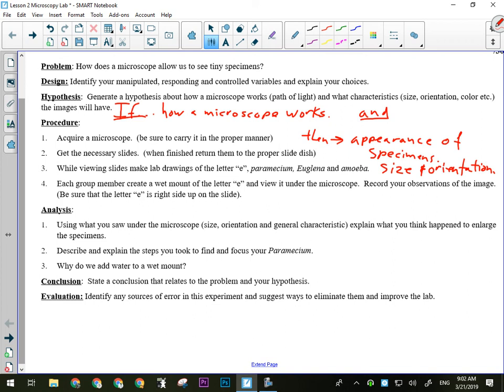We are going to do the observations in this order. Letter E, number one. Amoeba, number two. Paramecium, number three. And euglena last. Make sure that we do them in that order because they do get progressively more difficult and smaller. And as a result, you need a little more experience each time. So you're going to make a wet mount of the letter E. That's the first thing you're going to do.